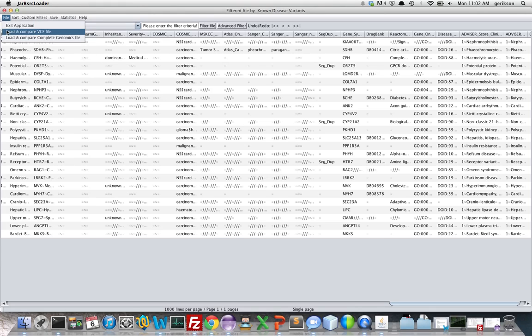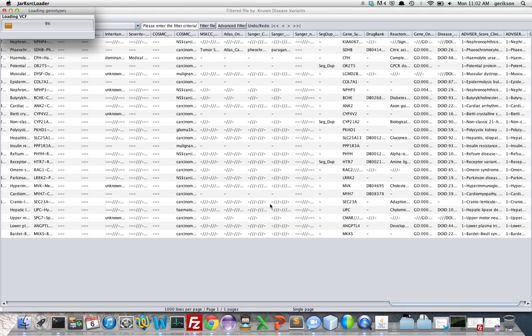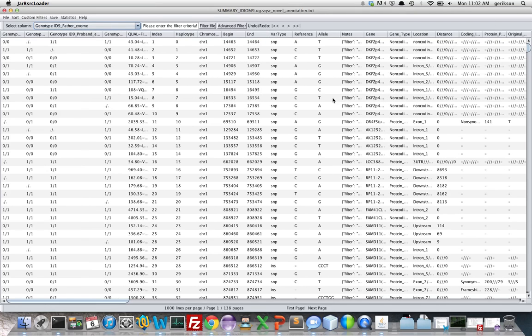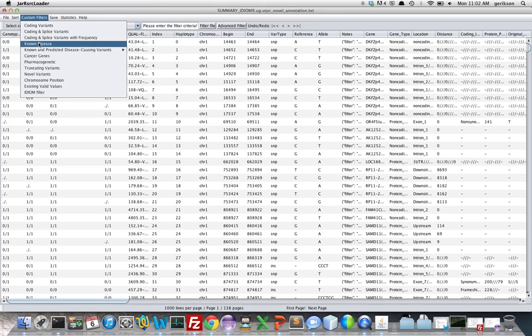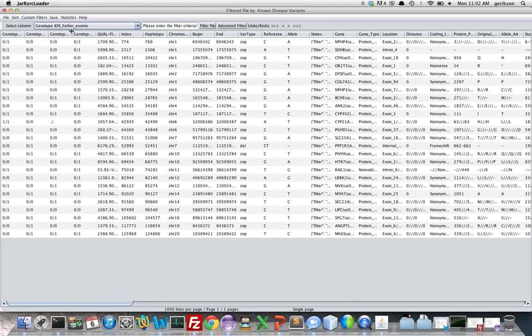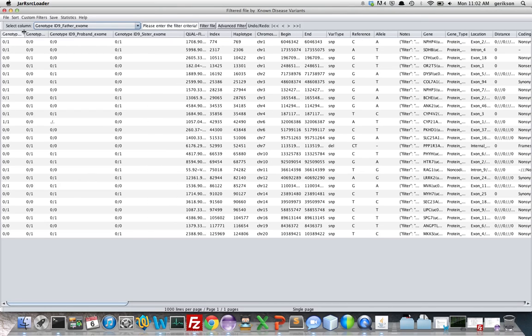To do that, you load and compare the VCF file, desktop, patient 9. The progress bar tells you how long it will take, fairly fast. So we're back to the main filter. Once again, we do the custom filter, the known disease filter, and you can see here the proband genotype. None of them are homozygous or de novo variants. These are the sister, mother, and father genotypes.